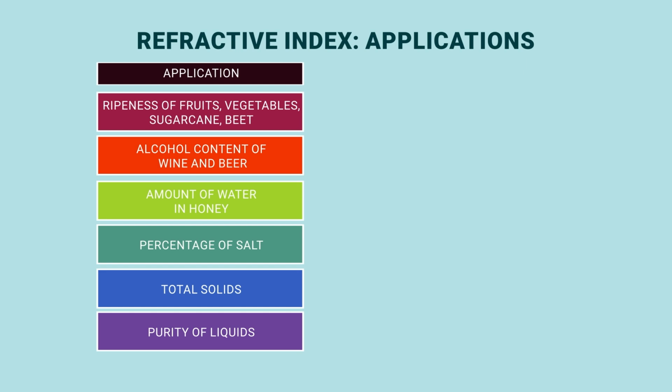Purity of liquids, how pure the vegetable oil is. For example, if there is adulteration of vegetable oil, then you can detect it by refractive index. How do you measure the refractive index?